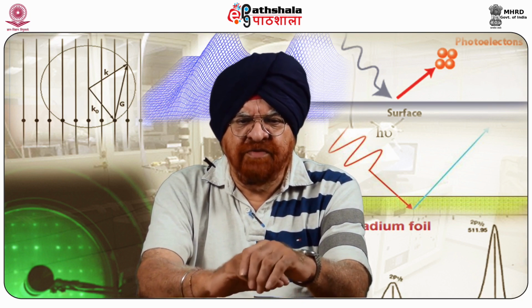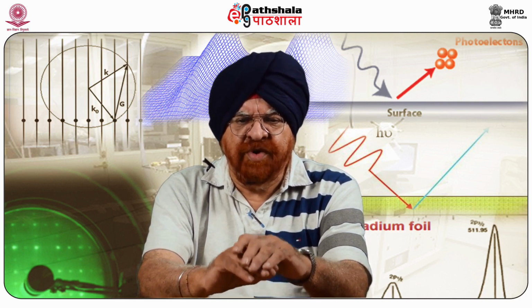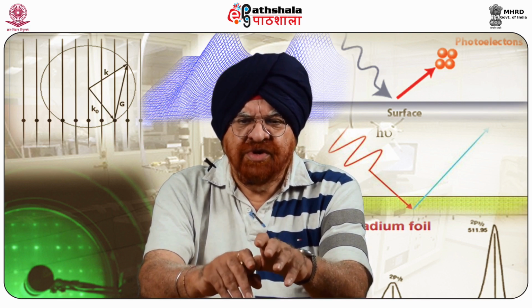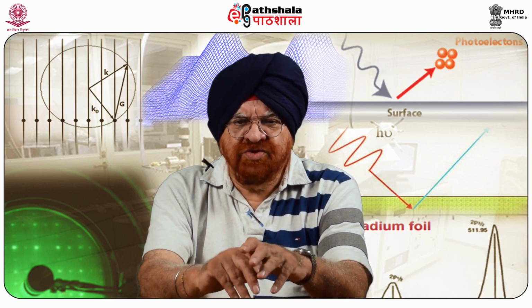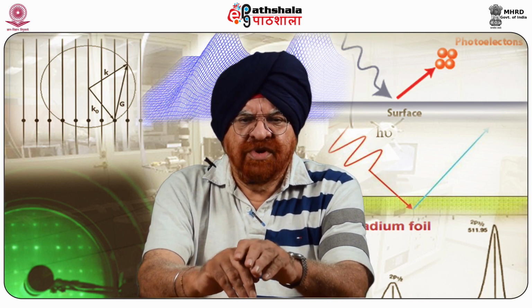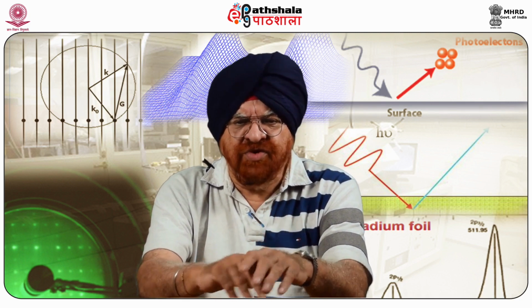The commercial platinum iridium coated tip does not require substantial tip preparation, but that shall yield low spatial resolution. C part of this would deal with hydrogen fluoride wet etching of silicon tips, followed by high temperature annealing, which has also been successful for high resolution KPFM imaging. Etching silicon tips is an alternative method to ion bombardment to remove the native oxide.